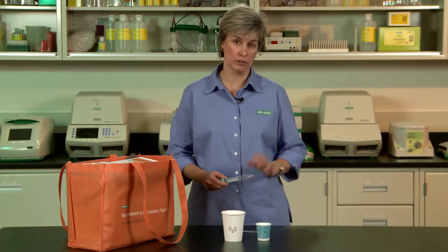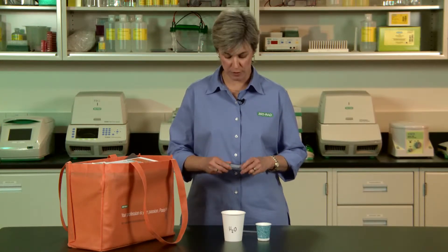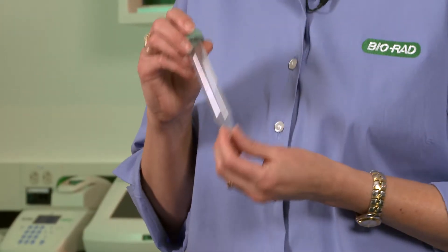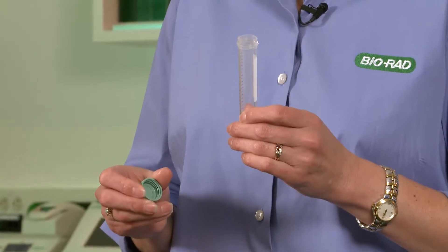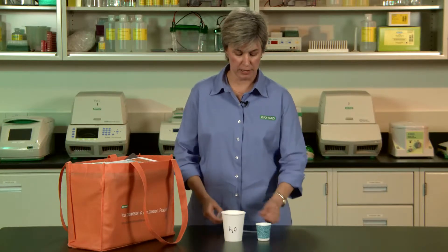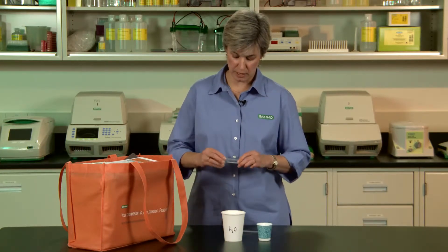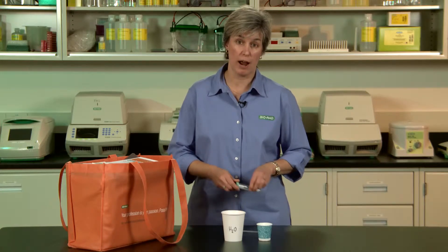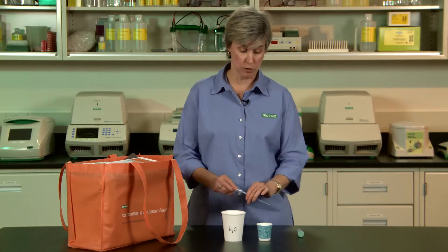One of the items on your list of additional supplies is paper cups. The reason for this is that the small 15 ml tubes provided in the kit can be a little tricky for younger students to spit into. So after they've collected their cheek cells, instead of going into a tube, it's great to have them use small paper cups. And if you want to give them an opportunity to practice using a transfer pipette, have them pipette the water they're going to use to collect their cheek cells into their cups.